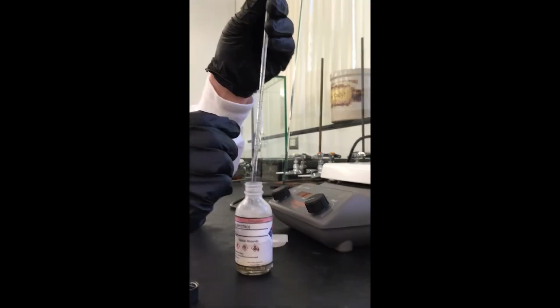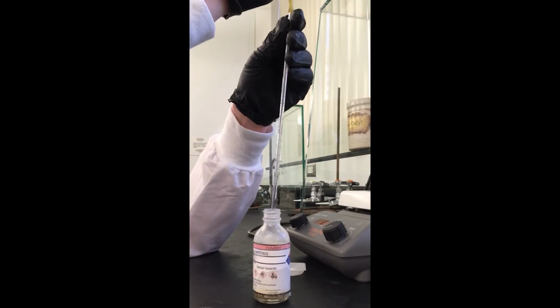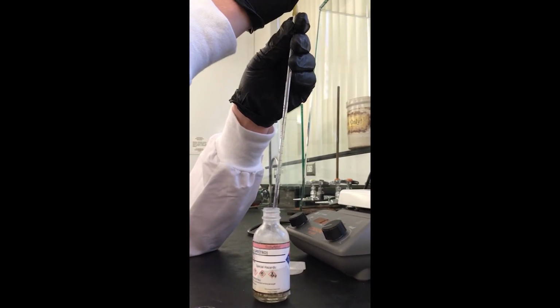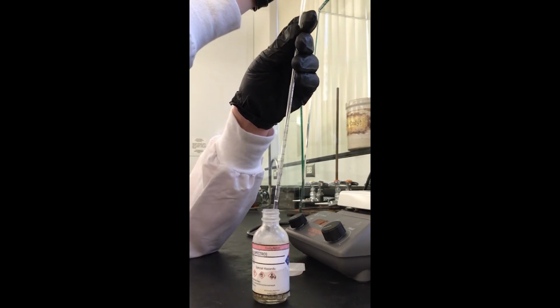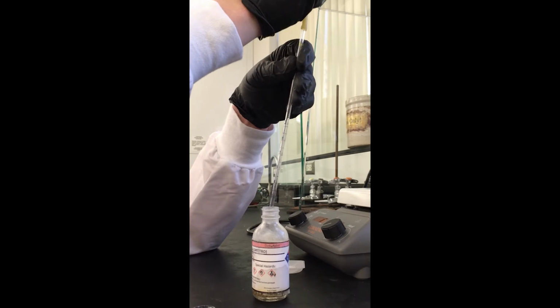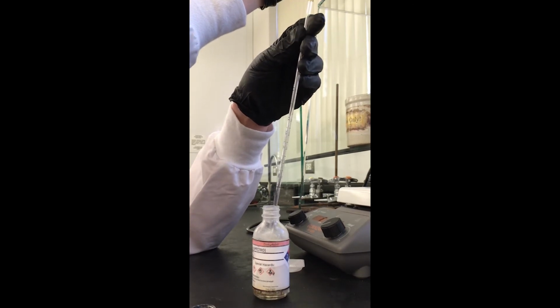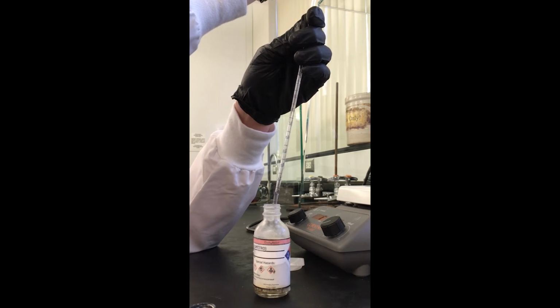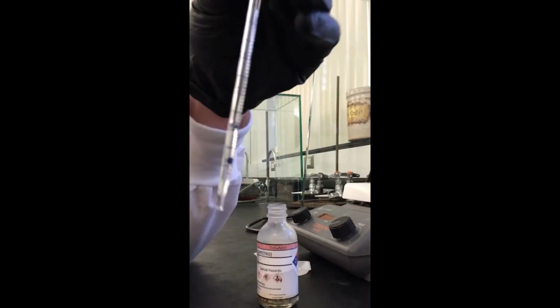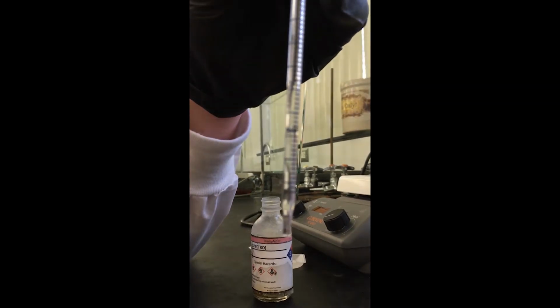It's actually 100. Okay, and then I'm also going to measure out 200 microliters of xylene. You can see right there at 0.2.